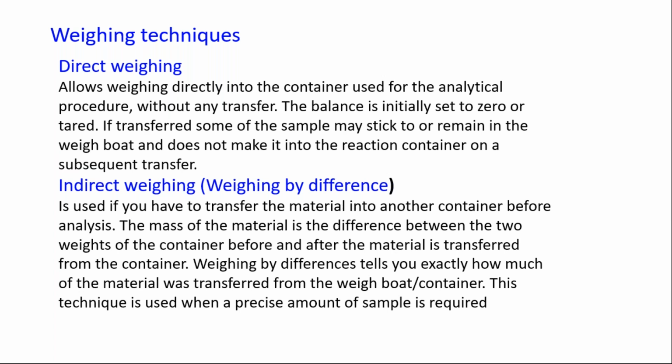So this is known as weighing by difference, and it is more accurate, and it is the method which is preferred in an analytical laboratory.